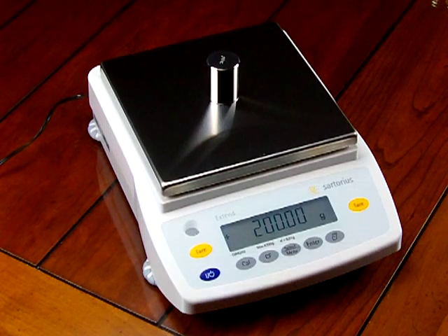Sartorius' corporate headquarters is in Germany, but they do have offices in the US. They have a manufacturing facility in Colorado and a sales office in New York. This balance, the GW6202, is made and assembled in the United States of America.